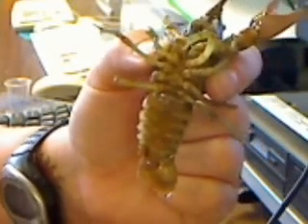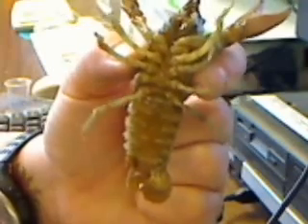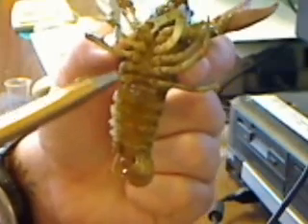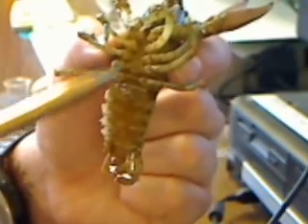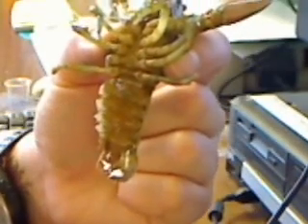Now we're going to look at the difference between a male and female crayfish. If you notice up in this area, we don't really see any pronounced swimmerettes. This is a female crayfish. When there aren't any pronounced swimmerettes up high, it is a female crayfish.